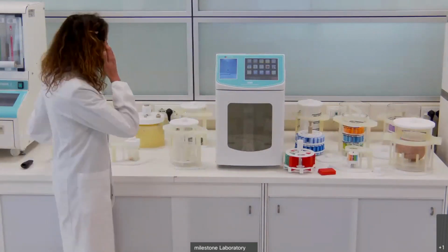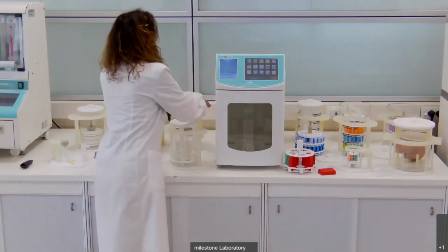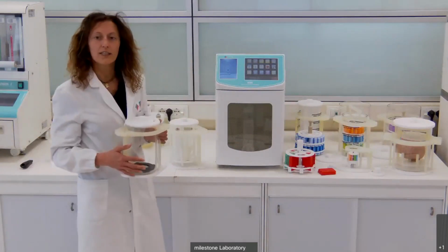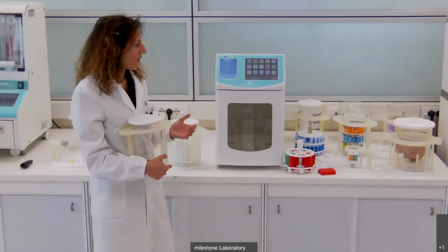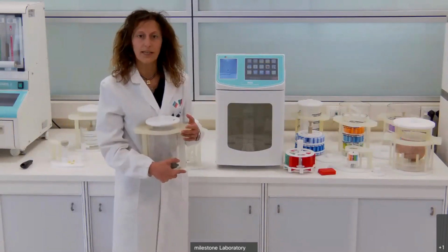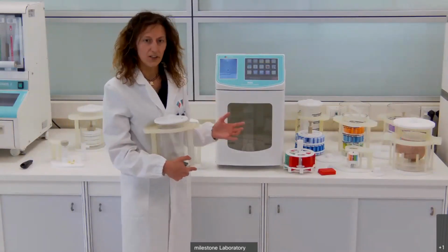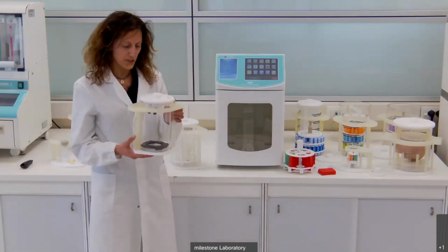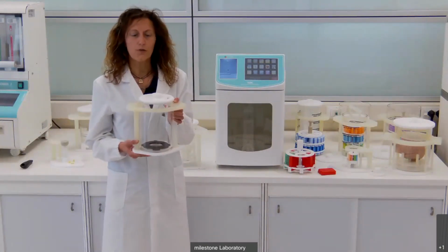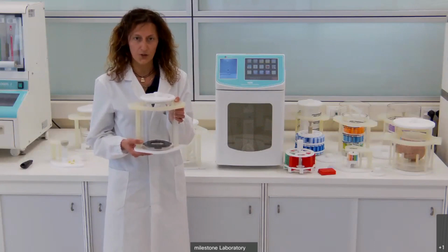So to perform the tissue processing, the samples are fixed before. In the COS you perform the dehydration, the clearing, and after this step you can use this dedicated module to perform the wax impregnation.